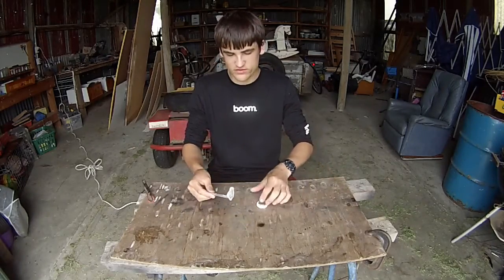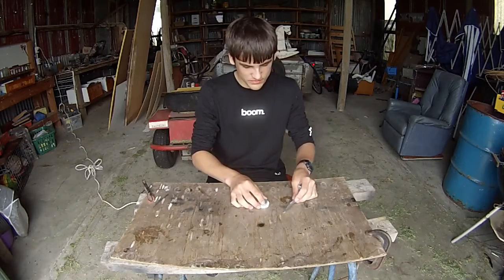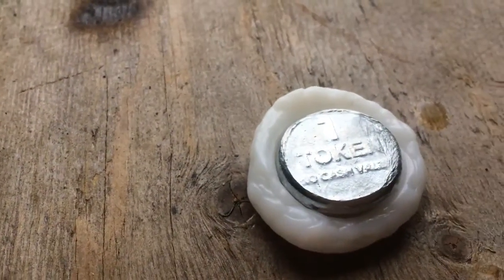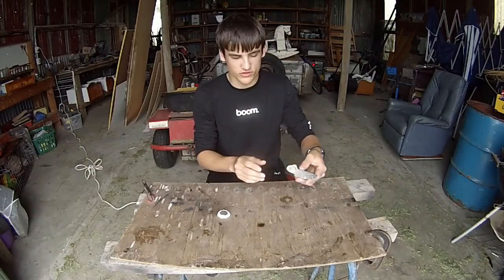Now this experiment is nothing new to YouTube — it's all over it — but I've always wanted to do it ever since I got gallium. Today I'm using the little gallium token that I made in a previous video, and I'm going to be putting it on this knife, a little aluminium knife that I also made with some of my friends a long time ago.